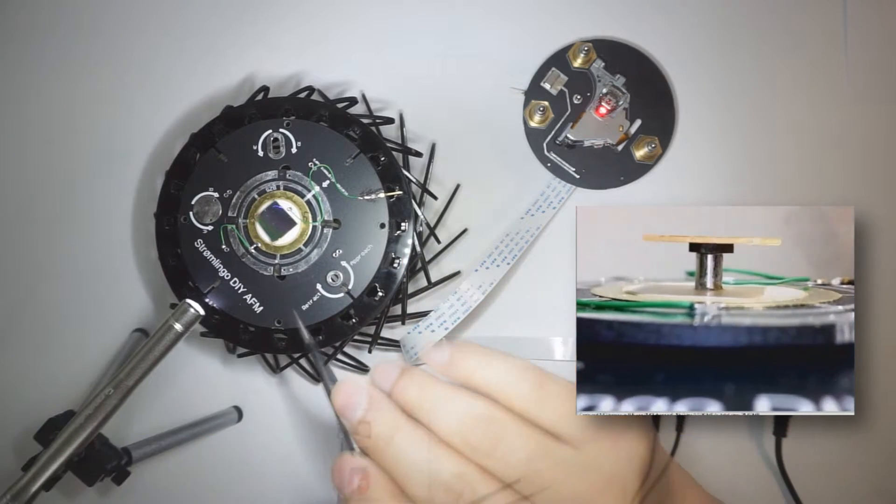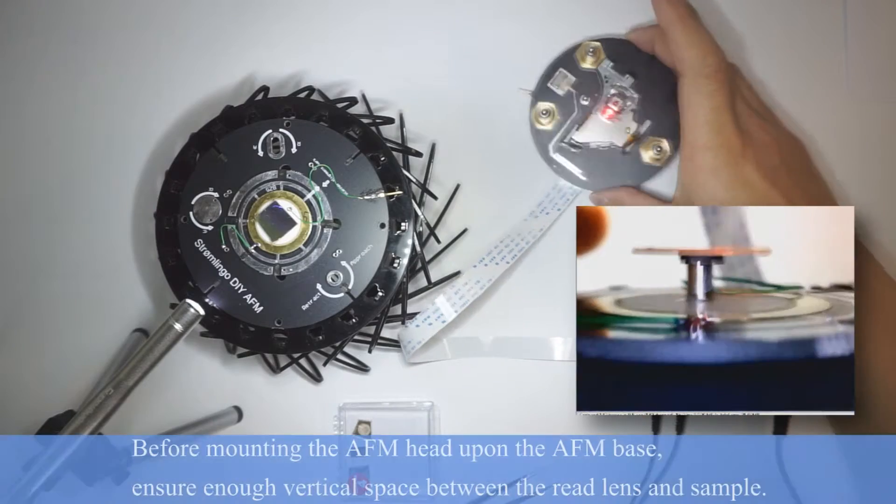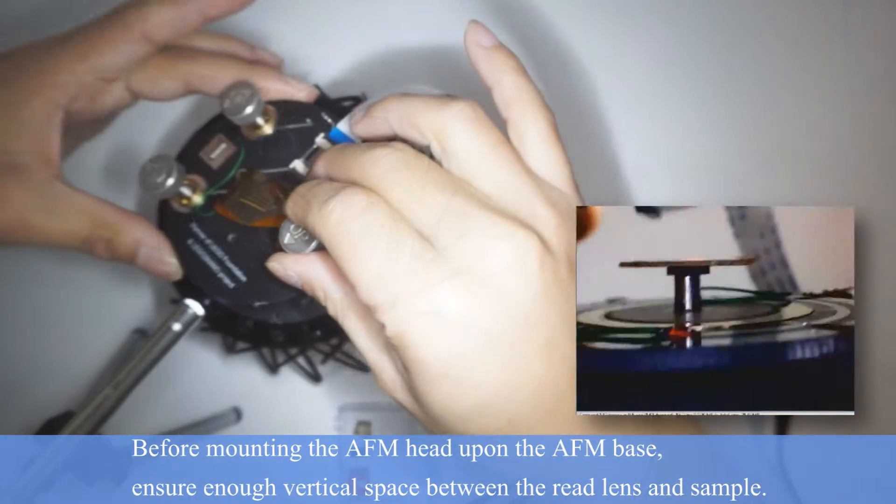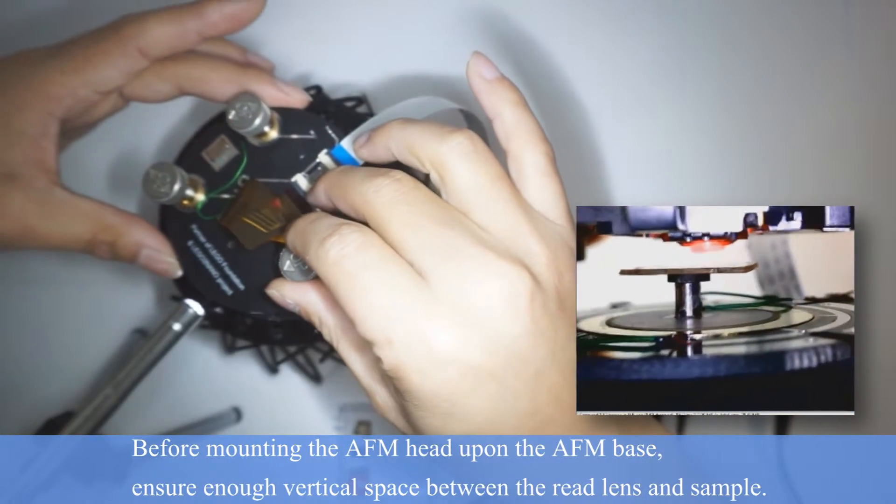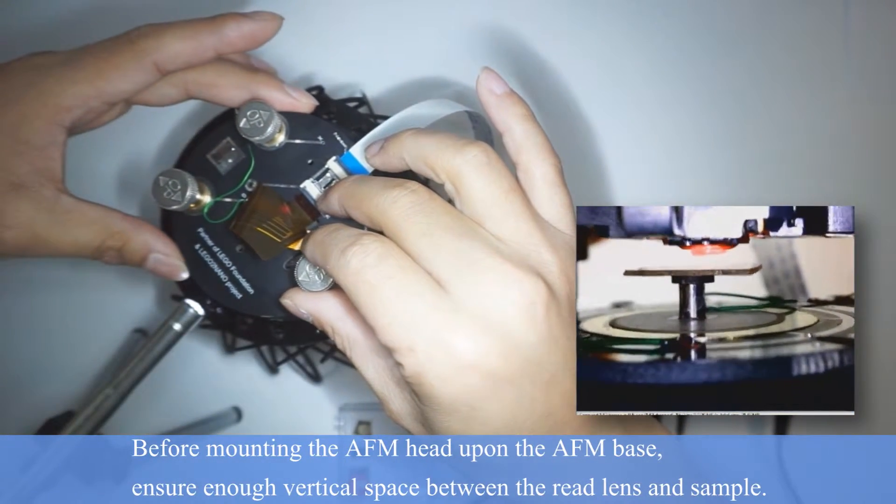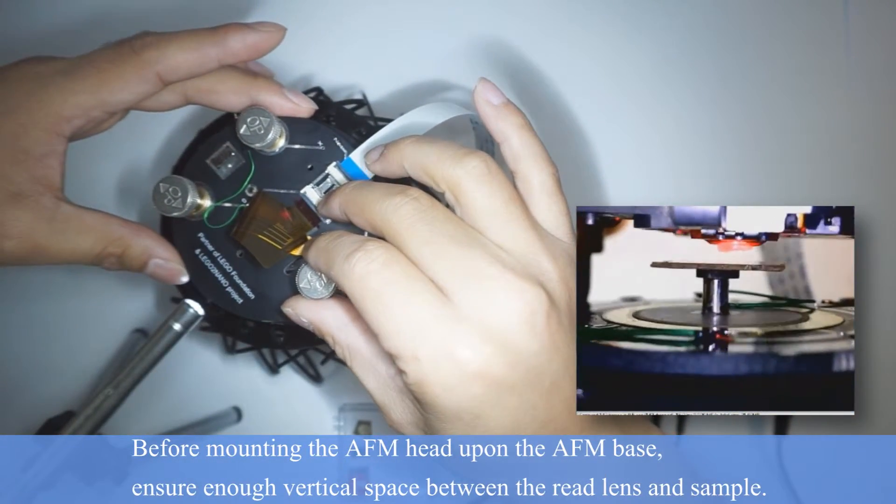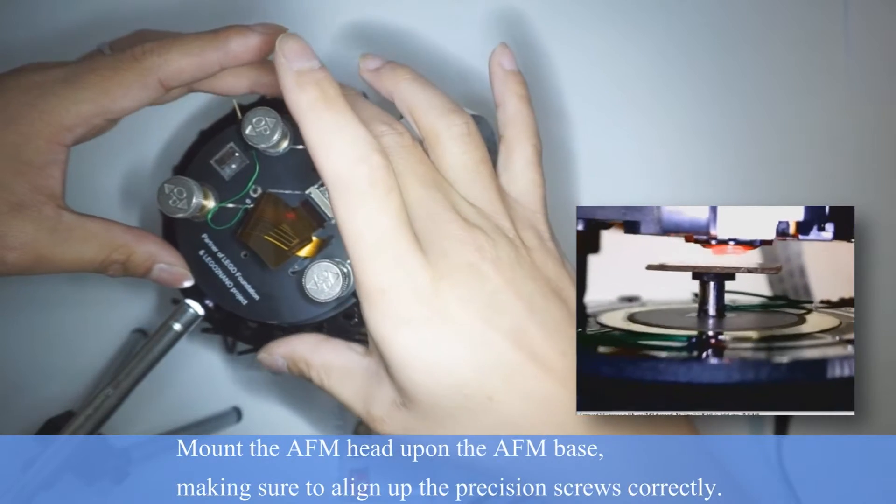Now let's load the AFM head, but make sure there's enough space between the read lens and the sample.